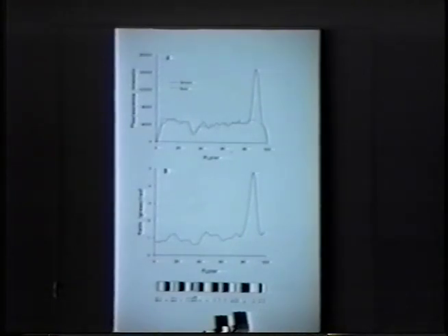But that's not particularly interesting if you know what's amplified in advance, but if you don't, then it becomes much more interesting. This is a breast cancer cell line, SKBR3, which is known to be amplified also for c-MYC. Again, this is chromosome 8 here, same representation as before, and you can see out at the end of chromosome 8 there's a bright green spot corresponding to c-MYC.